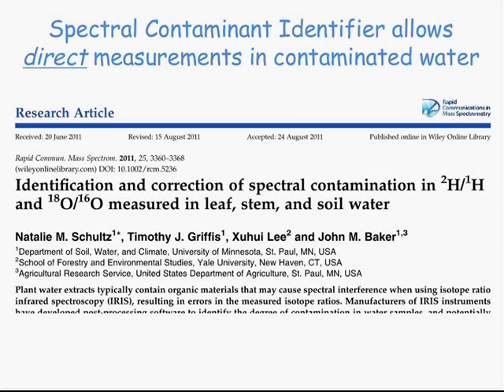Okay. Understood. Then the final question I have is from Ty Copeland. What is the plan for compatibility with LIMS, Laboratory Information Management Systems, to laser specs used by laboratories in at least 10 countries? And I'm suspecting that means in traditional mass spec, IAEA kinds of things, that there's a standard LIMS for that. Yes, of course.